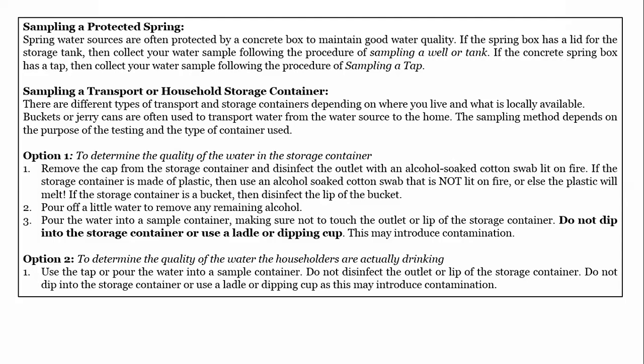First is to just take the container, if it's a bucket or whatsoever. Make sure that you don't take a cup from outside the area, or take your hand and your sample container and put it inside this bucket. It is wrong. We don't carry out the sample like that. You don't need to dip your sample container inside the drinking bucket. It is wrong practice. So what you do is stand up the drinking bucket, and take your sample container and pour the water into your sample container.